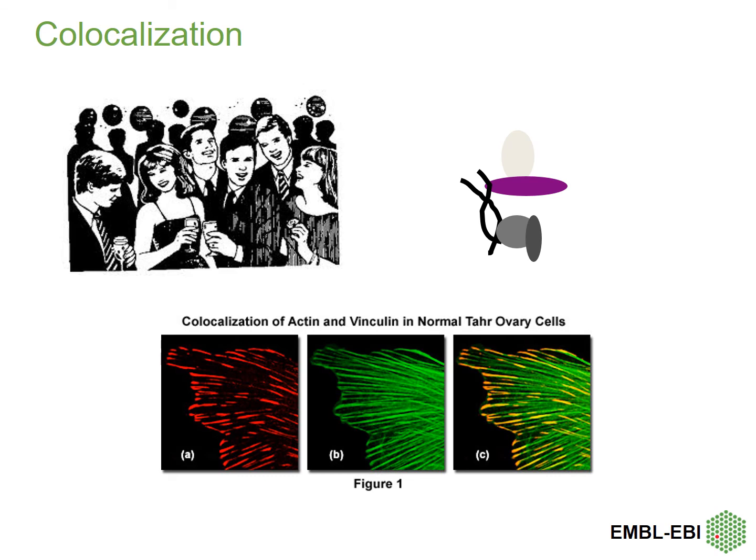Green is actin only, and I don't know if there's any vinculin only, and I don't know how much red only there is. So it looks like there's more vinculin that interacts with actin, but not more actin that interacts with vinculin, based on this figure here. Okay, based on that.